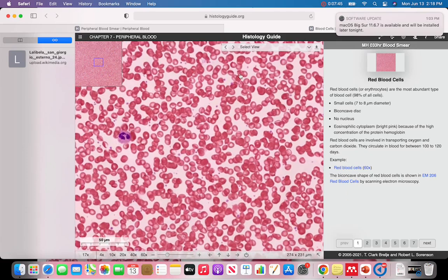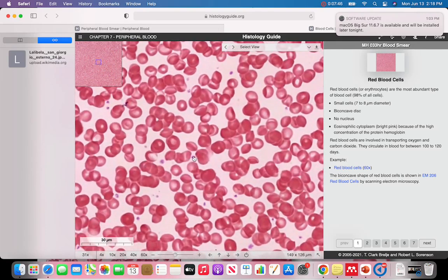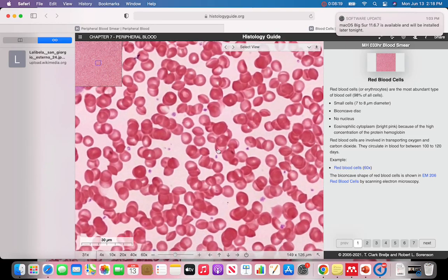These are the most abundant cells. Eosinophilic cells are the red blood cells. And in between the red blood cells, these very small sacs of cytoplasm, which are fragments from megakaryocytes, are platelets.